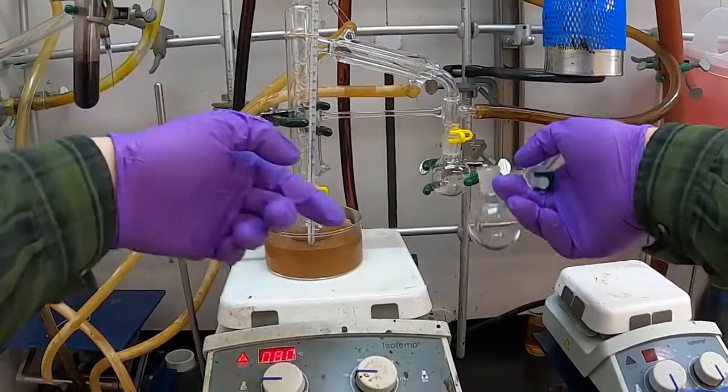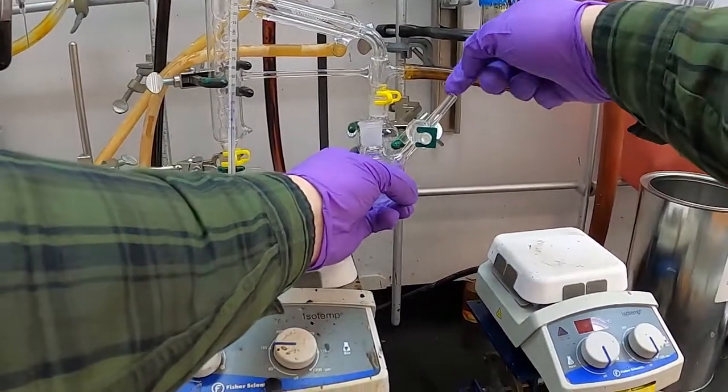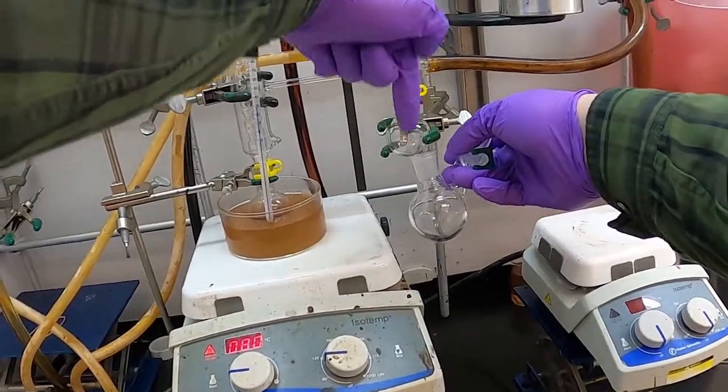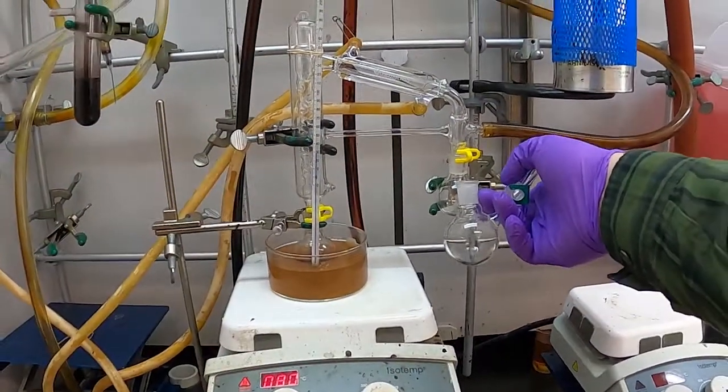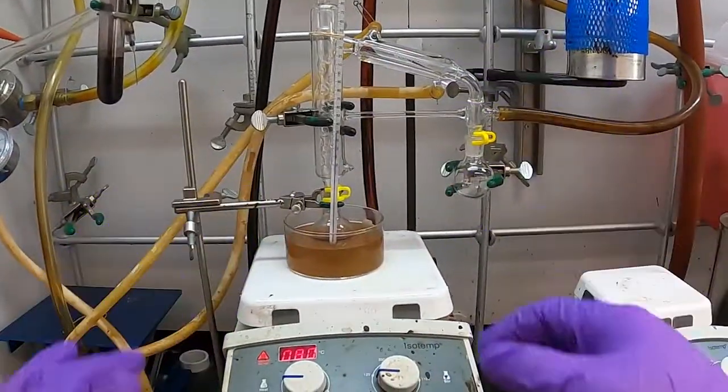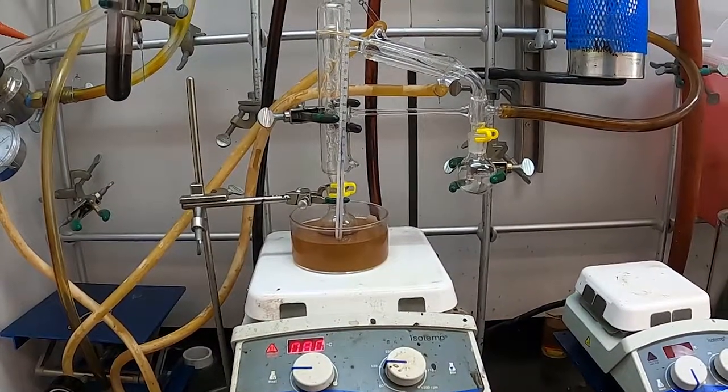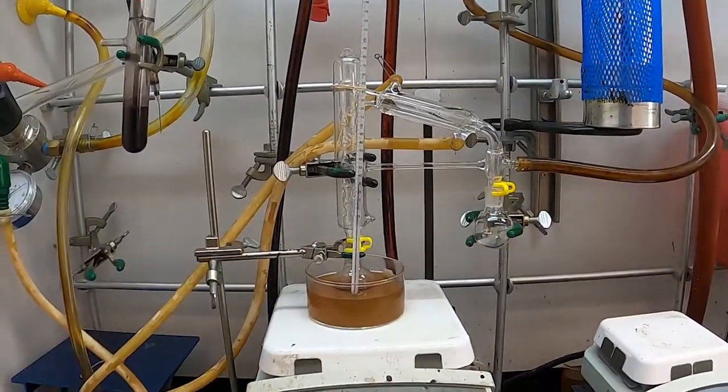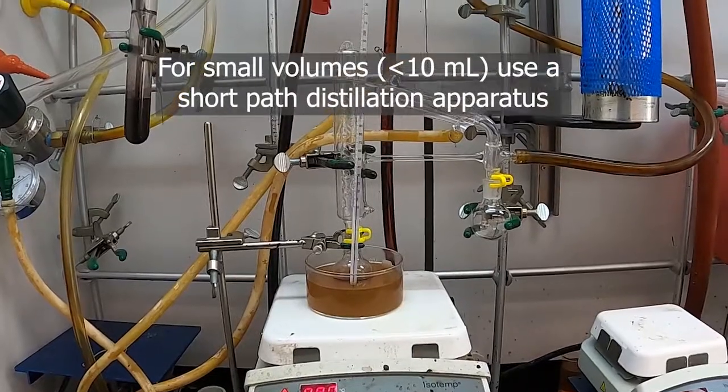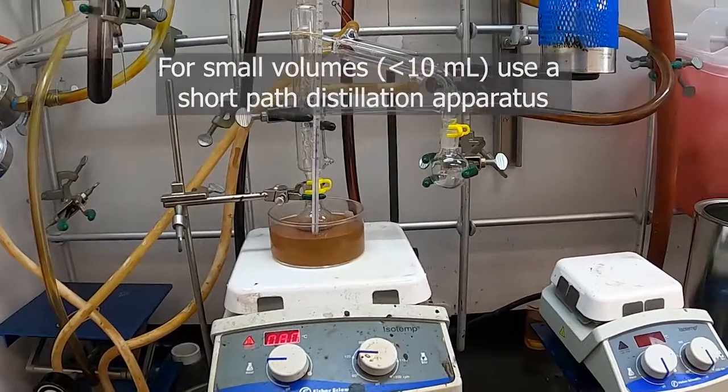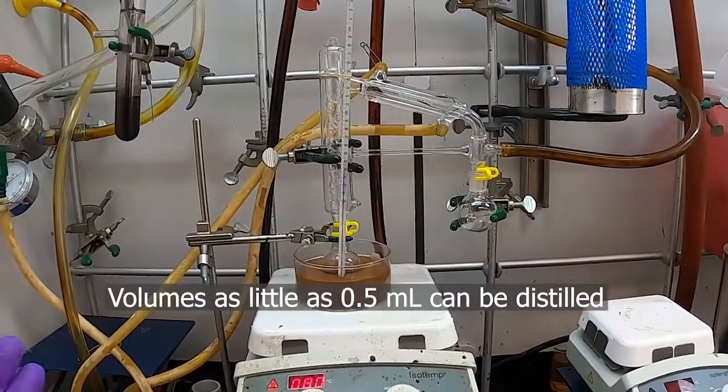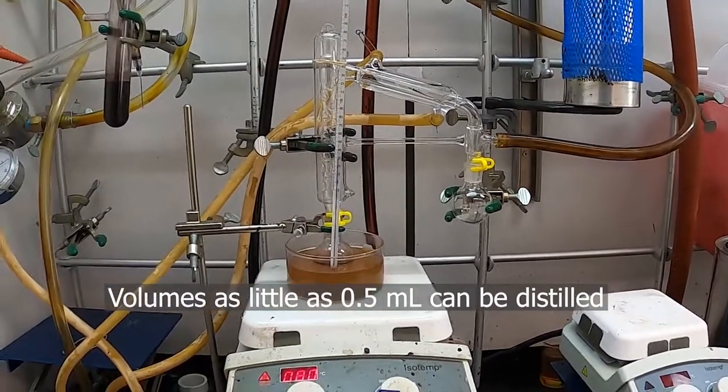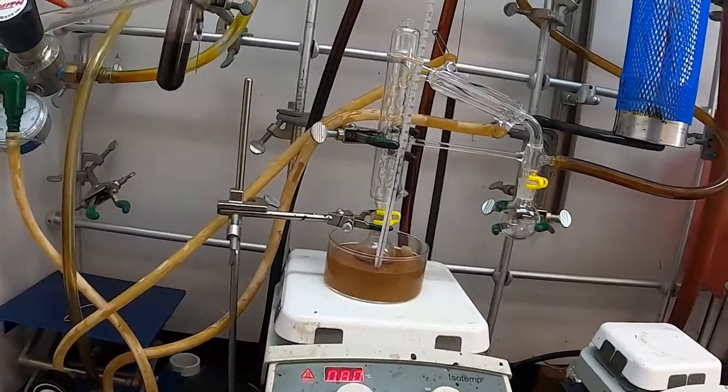You might actually have to put nitrogen in from both sides. So you can have a nitrogen tube in here, push nitrogen up through as well as to put nitrogen into the Schlenk on this side, so that you can have that purging out of this one so you don't get gas going back that way. So it can be a bit tricky and more kind of a pain to deal with, but it is possible to do distillations like that with more sensitive compounds. Additionally, you can distill really small volumes. There are smaller apparatus that you can use that are overall smaller columns, smaller condenser portion if they even have one. So you can even distill volumes as small as one milliliter or half a milliliter, but it's easier to distill larger volumes. It just gets really difficult when you get to really small volumes like that. Anyway, we'll keep moving along here with this distillation.